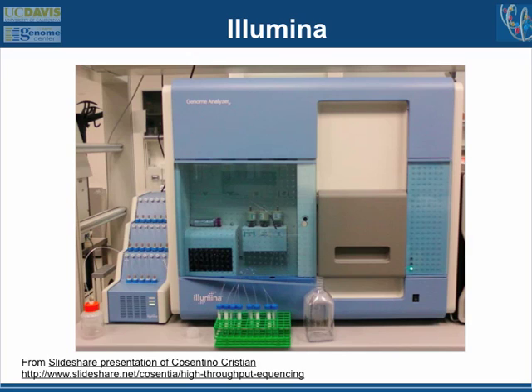What people do now is they tag each sample. If you wanted to pool 100 samples into a single run, when you ligate on your adapters, you can add an extra few bases to it that will tag your sample with, say, 10 nucleotides or 4 nucleotides that correspond to sample 1, and 4 other nucleotides that correspond to sample 2. And then when you pool everything together, you just figure it out bioinformatically afterwards which came from which sample. It can be very challenging to pool those together in the right relative abundance to get equal number of reads from each sample. That's a fine-tuning that is very hard to get to work. Does that make sense?